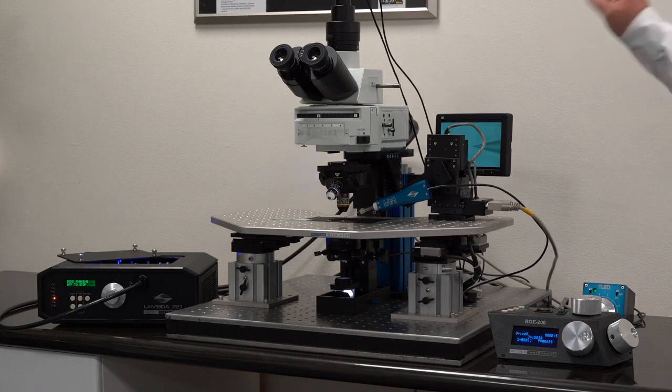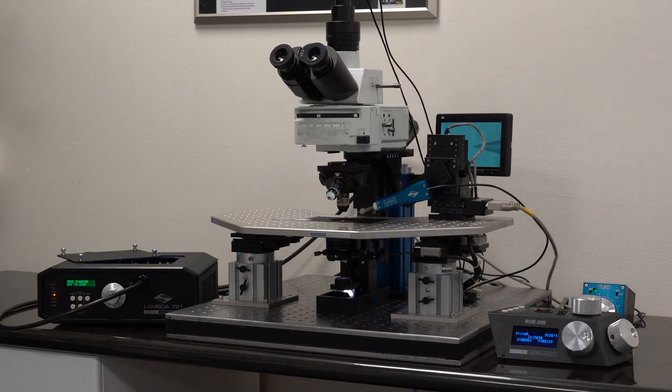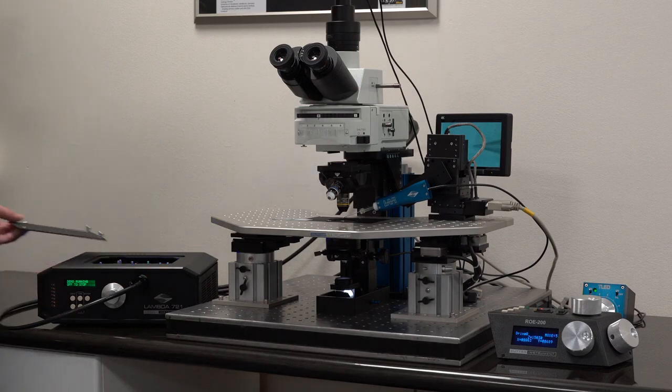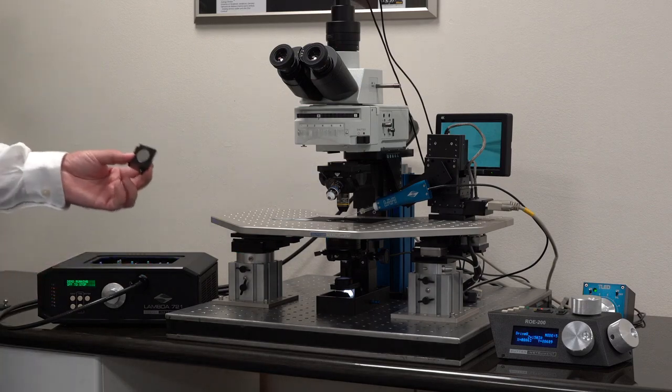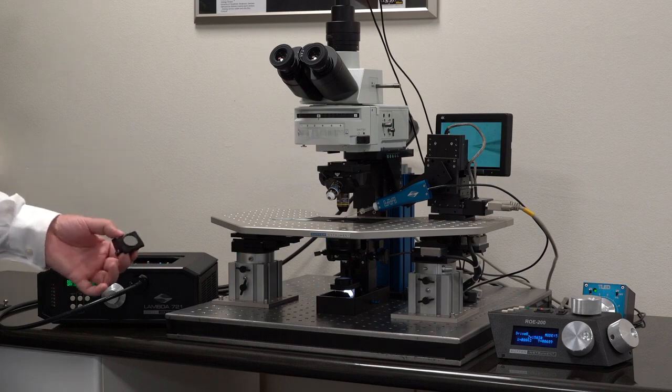This microscope is also using the Lambda 721 as the epi source. And I'm just going to talk about it briefly for a minute. And that's this light source right here. It combines seven LED cubes into a single output path without the use of any dichroic mirrors.